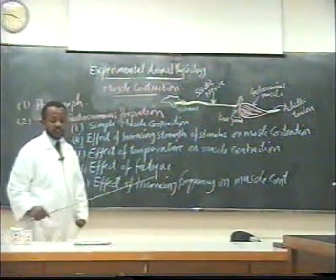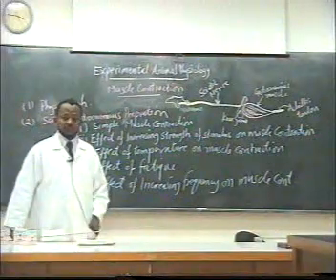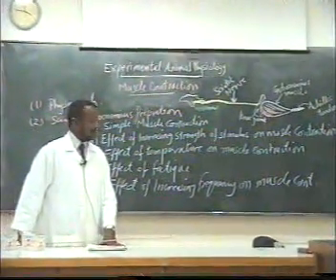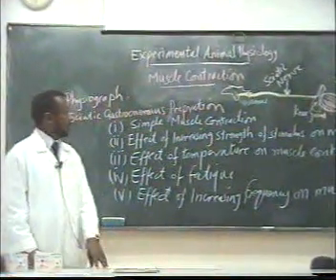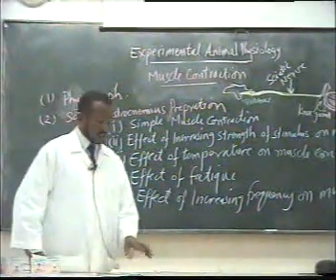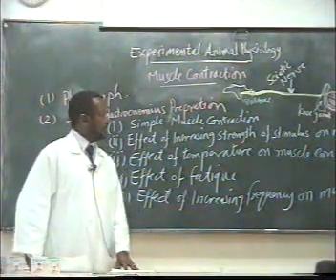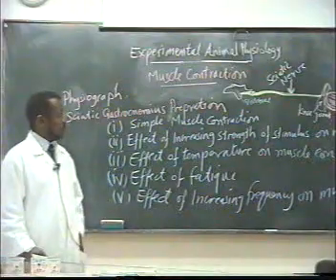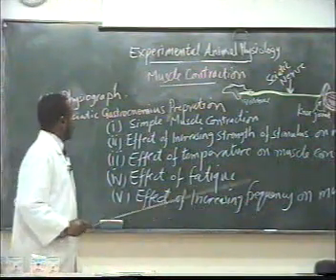Usually in these practical classes we use the frog as the experimental animal. As we know, frogs and amphibians are used in biological study experiments because the tissues of these animals can resist manipulation during the experiment, which is due to their low metabolic rate.